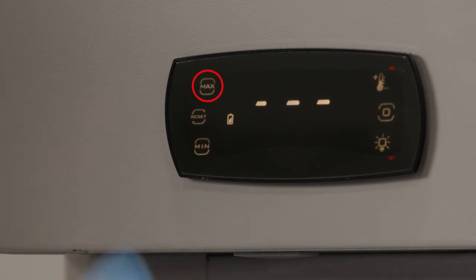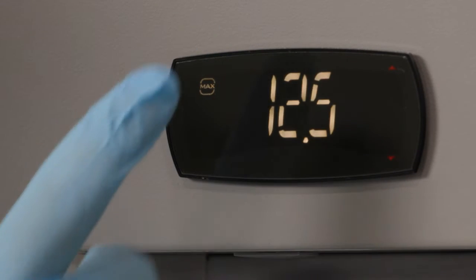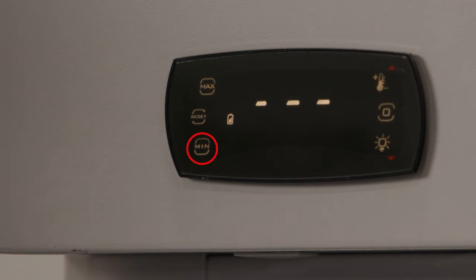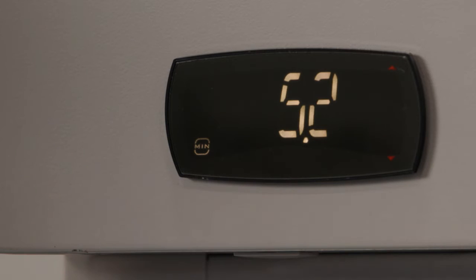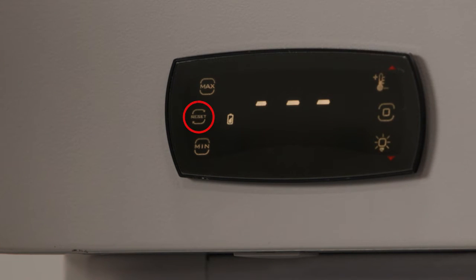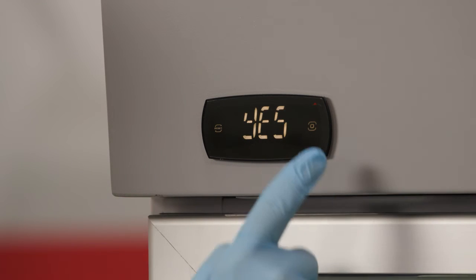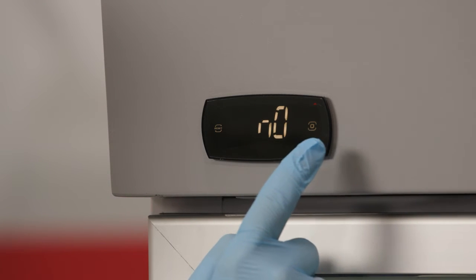Three capacitive buttons reside on the right and left sides of the controller. The max button in the top left position displays the highest recorded temperature since the last time it was reset. The min button in the bottom left position shows the lowest recorded temperature since it was last reset. The reset button in the middle left position clears both the minimum and maximum recorded temperatures. When the reset button is pressed, the user must confirm the action by pressing the program button in the middle right position.